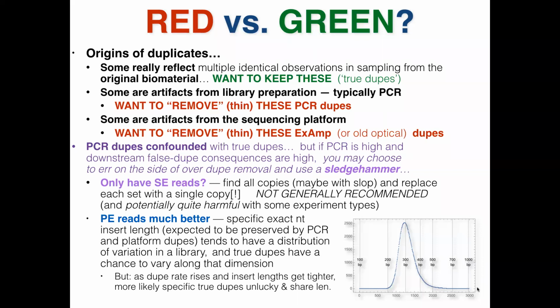Now, you could be in a region of poly-T, and if the genome has 1,000 T's in a row, when you slide around you're not going to know where you are in those T's. But most genomes, if I point anywhere in the genome and slide around 100 bases in the window, the sequence changes. So it's not perfect, but that's great. What that means is that when you do paired end removal, even if you're only matching sequences, you've got a chance that you're actually doing the right thing, because the true duplicates have the spread, and that is reflected in that even if the first end is matching, the second end is going to vary based on that insert.